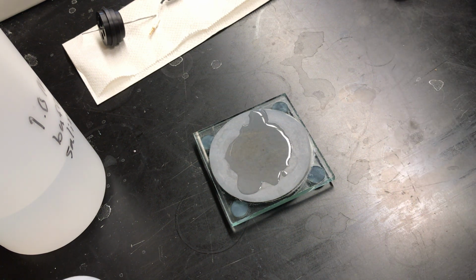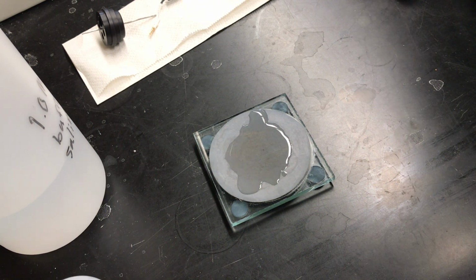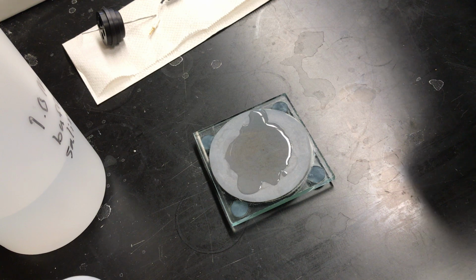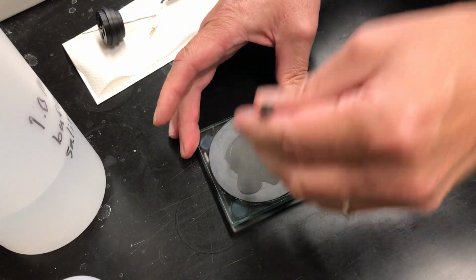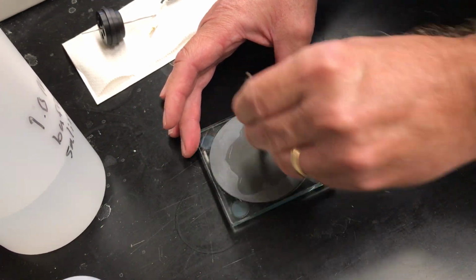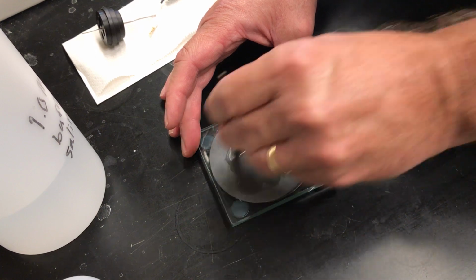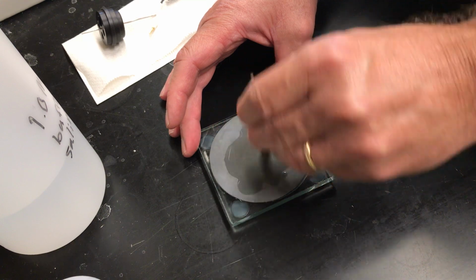Now what happens is that organic matter will absorb to that carbon disc. So what that means is that the electrode will be fouled. So we need to clean the electrode now so that efficient electron transfer can take place there. So essentially I have some sandpaper here that I've wetted down, and I'm just going to grind the electrode along that sandpaper there to abrade off any material that may be absorbed to the electrode surface.